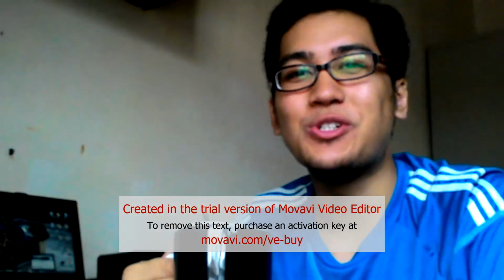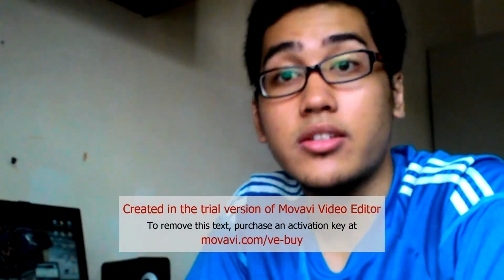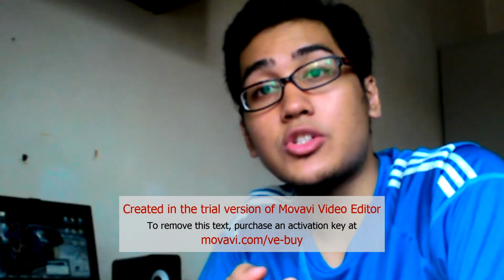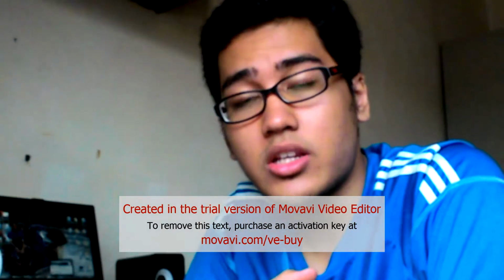Oh, sure. No problem. So when we talk about tubular photobioreactor, which is tubular PBR in short, I would say there are two crucial parts that contribute the most in the yielding of algae production, and these two crucial parts that I mentioned are solar receiver and also the mixing unit.